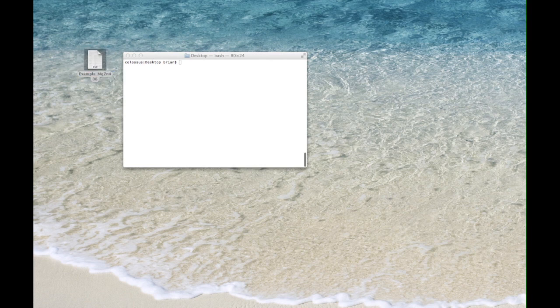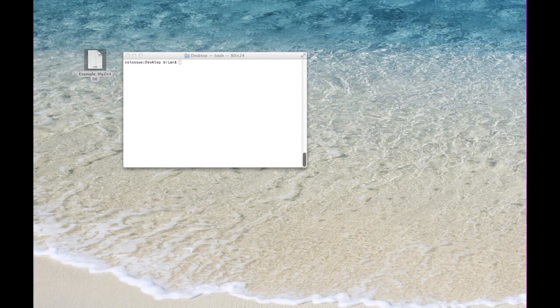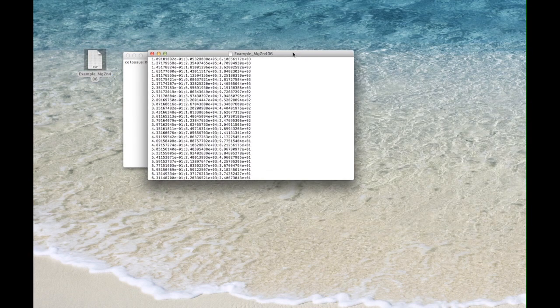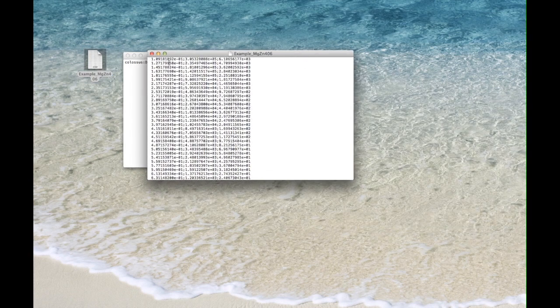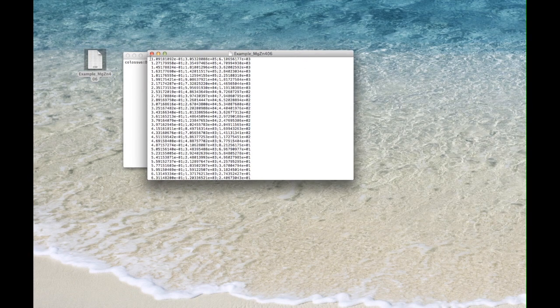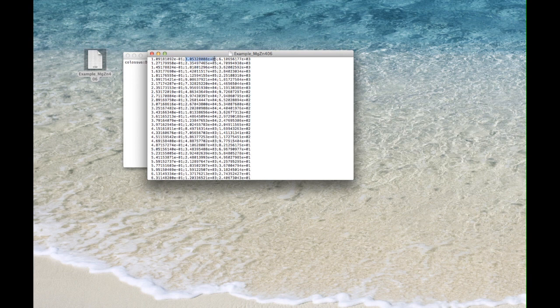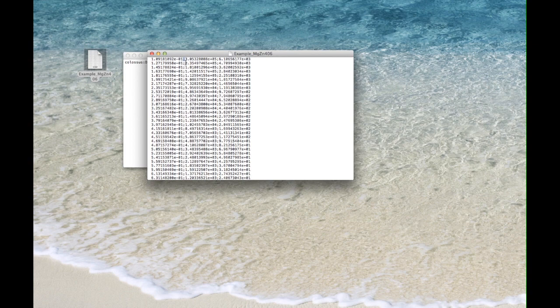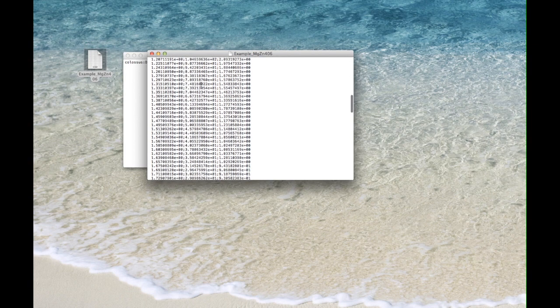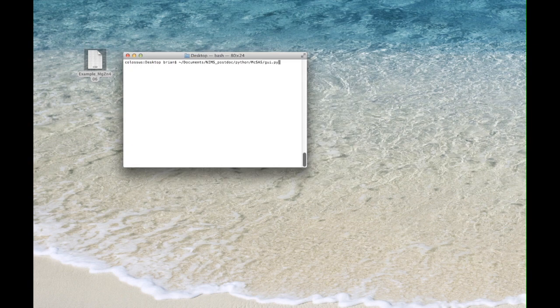My dataset is simply a semicolon separated file so you can see here the values for Q, intensity and the uncertainty on the intensity, or uncertainty estimate which are separated by semicolons. And this is all that's in this text file.